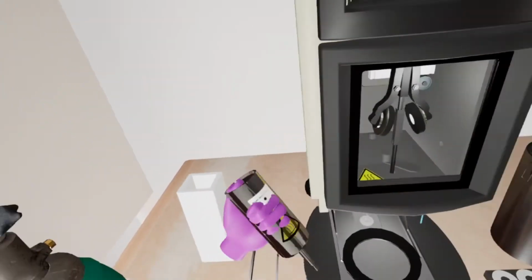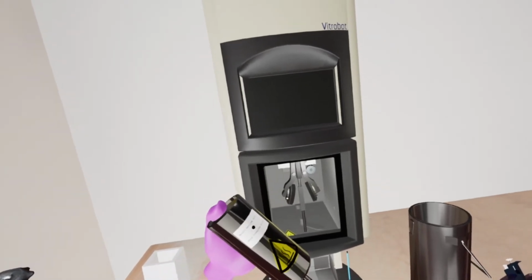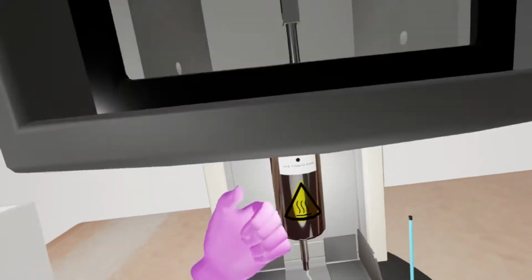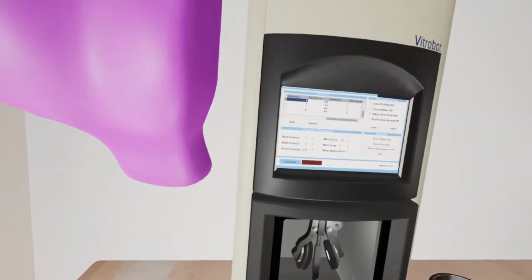Attach humidifier to Vitrobot, sticker facing forwards. Note that the humidifier has already been filled with 60 ml water via tube. Turn on the Vitrobot via switch on the back right of machine, and adjust settings as needed.